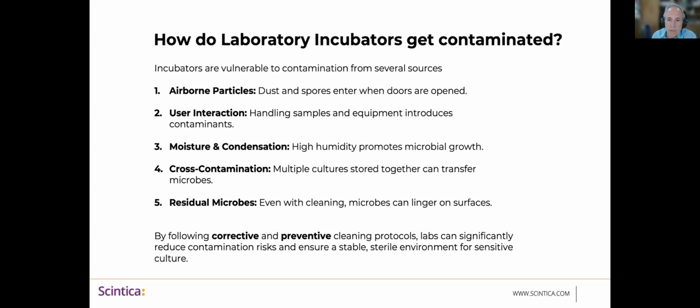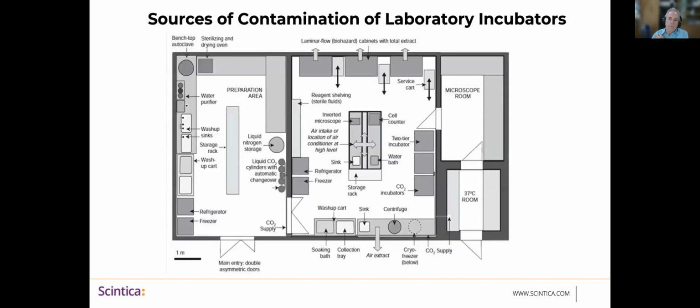These are two different approaches that people take to maintaining their incubators. Before we get into that, I want to talk a little bit about the very earliest stages of things that you can do to minimize biodecontamination in your cell cultures, and that is your lab layout.